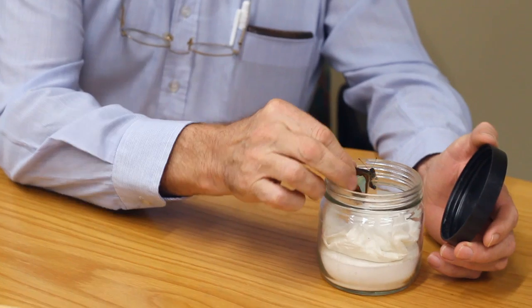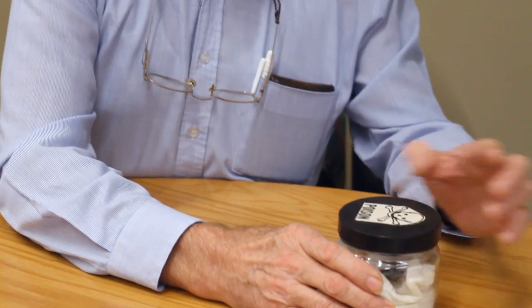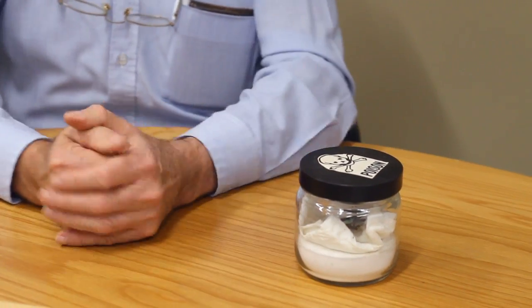Now that we have our insect we need to kill it. So we put it in a killing jar which contains a chemical called ethyl acetate, or you can use nail polish remover — non-acetone that has ethyl acetate in it. We place the insect in, close down the lid, and leave it there for about two hours.